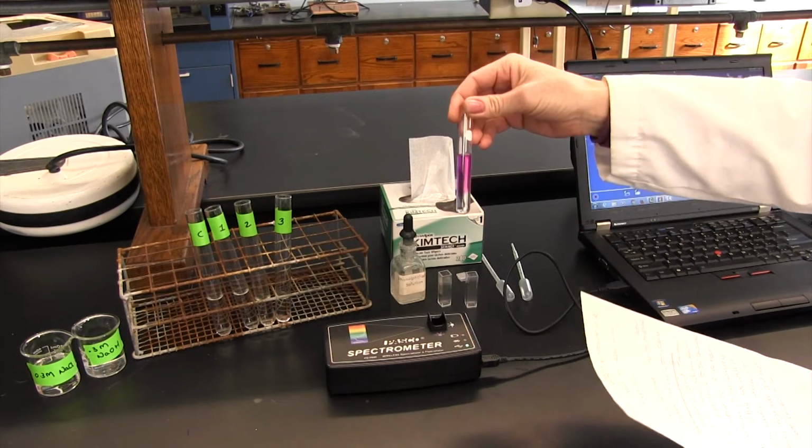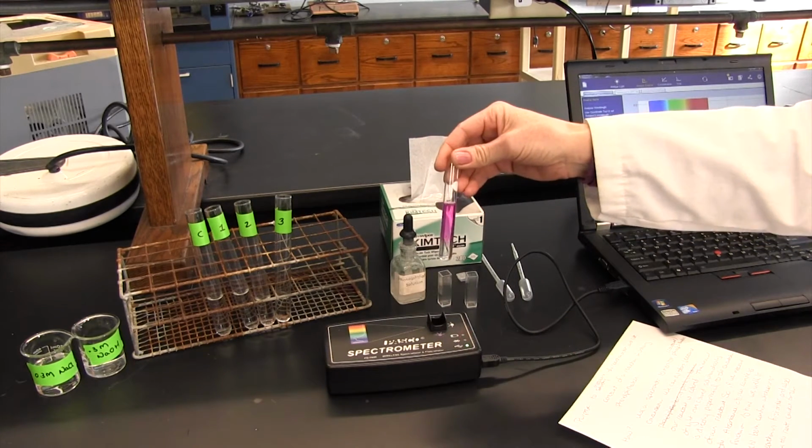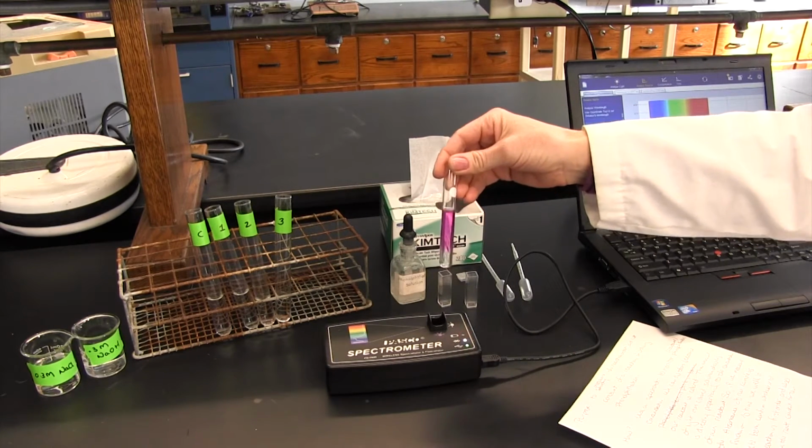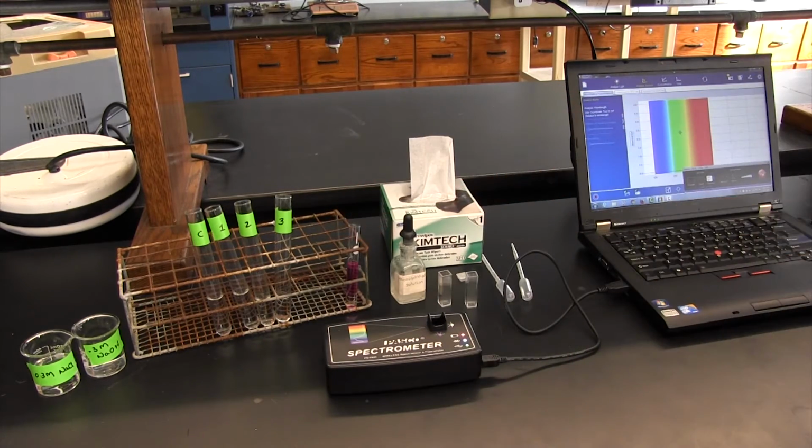So the amount of light that our spectrometer will measure as our sample is absorbing is going to be directly proportional to the concentration of our reactant. So if we measure the absorbance of our sample as a function of time, we'll be able to both confirm whether or not our reaction is first order and also measure the rate constant for this reaction.